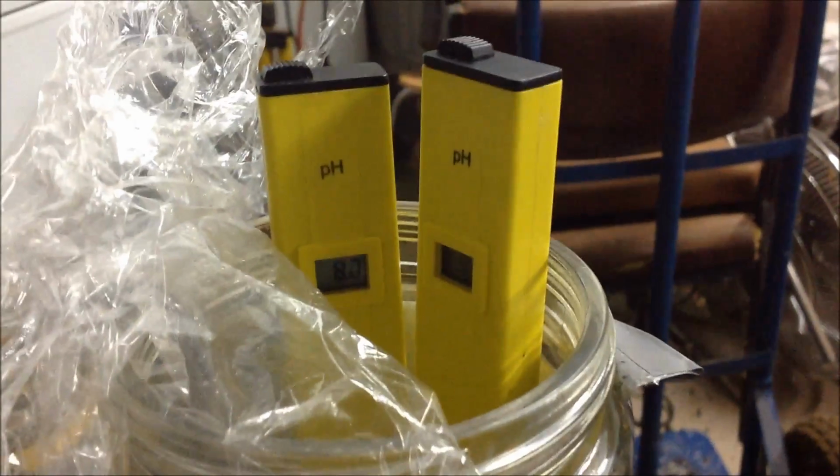These were both calibrated before this experiment, and they were reading exactly the same, whereas now they're 0.7 difference between them. I was going to take it to 8.5, and it's got to be pretty close. One of them's right, I would guess.